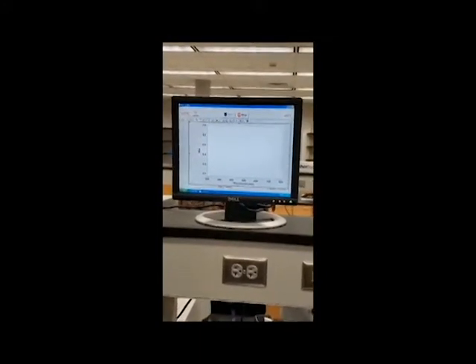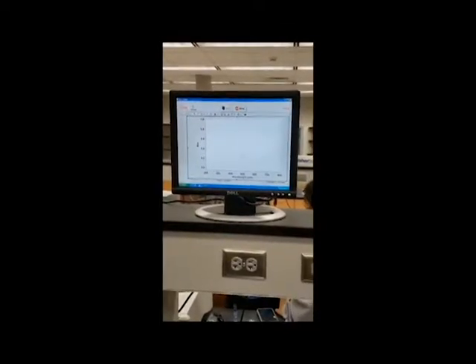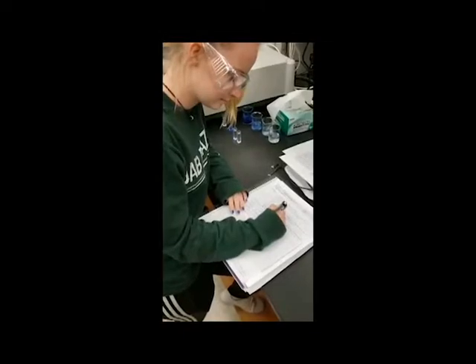And because some chemicals may absorb UV light and would be clear to the naked eye, but can be measured by a UV wavelength. Record the absorbance of your sample in your lab notebook properly.